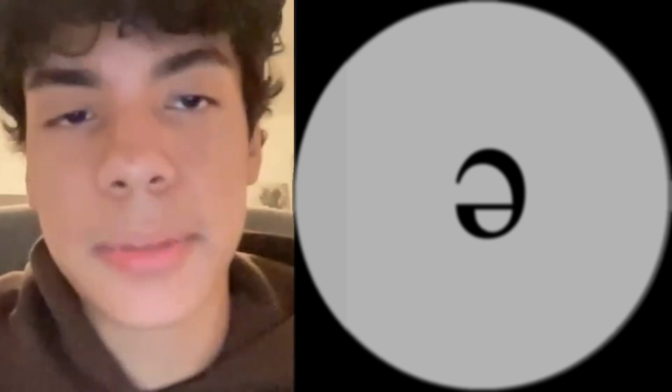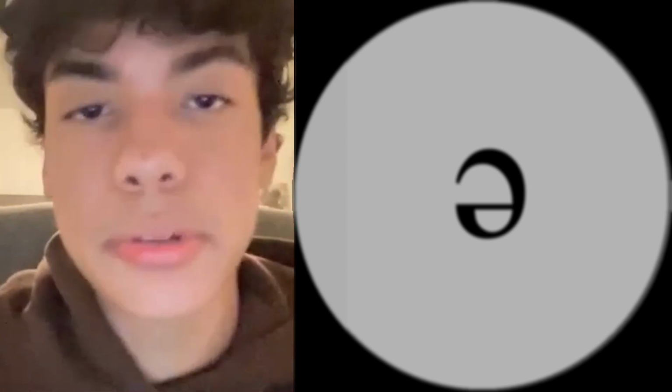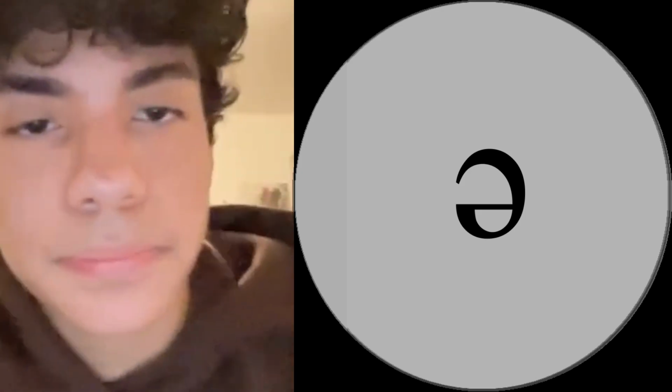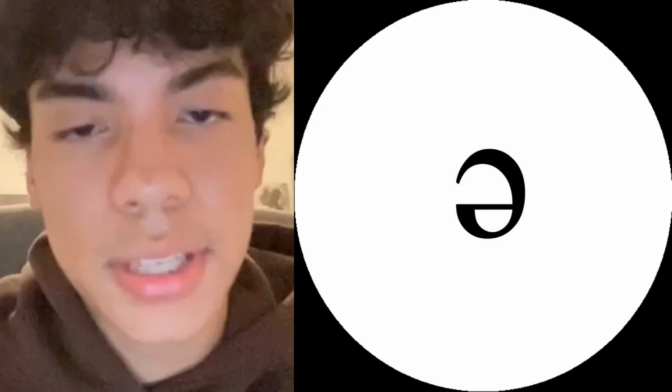Next, you want to focus the image by using the coarse adjustment knob to get the sample closer to the lens and the fine adjustment knob to make the image clearer on the lens. Next, you want to control the light. Increasing the brightness and contrast allows the sample to be as clear as possible on the lens.